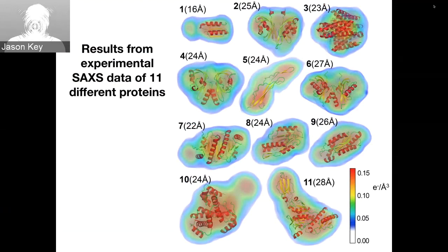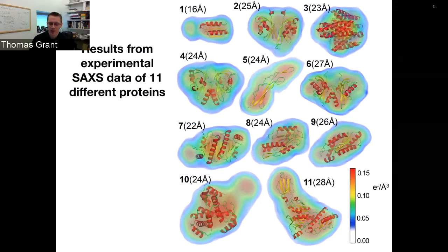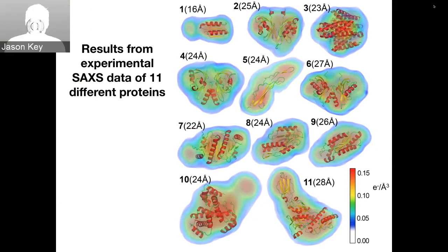Yeah, theoretically, sure. If you could separate out the biological portion of the density in the crystal, separate out what the asymmetric unit is from what the biological unit really is, then yeah, you could theoretically do something like that. It would be a very useful tool, I think, for more and more of these huge complexes.